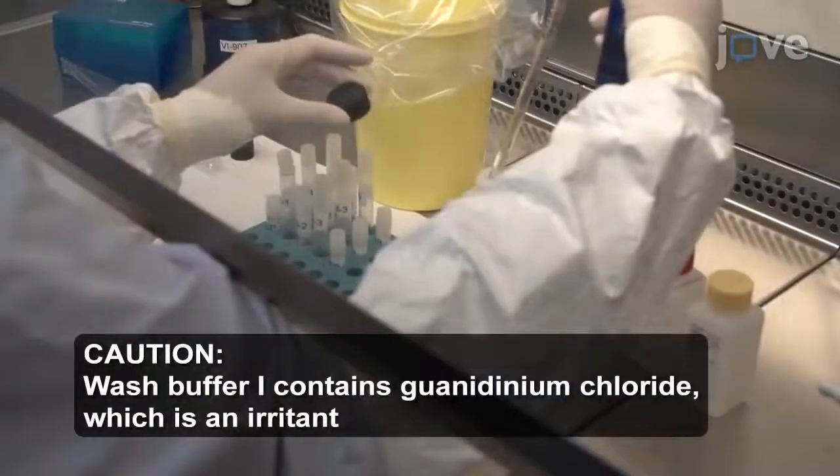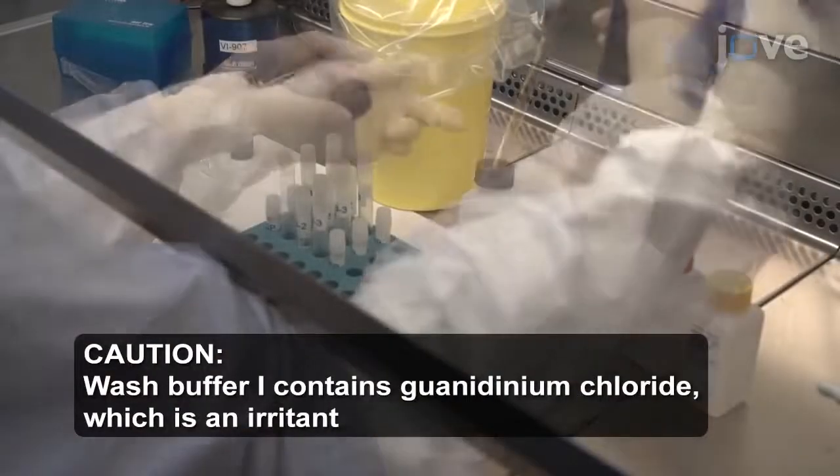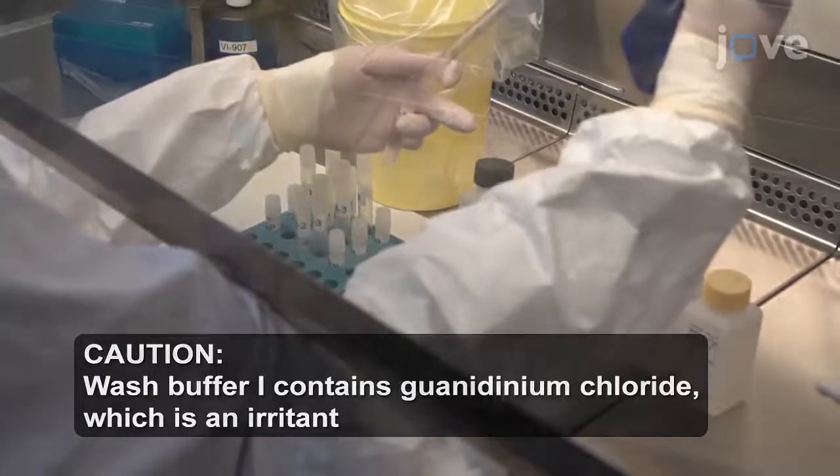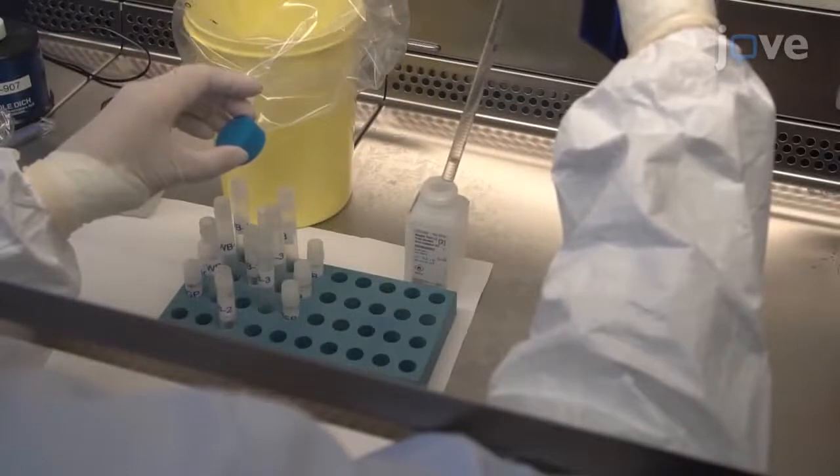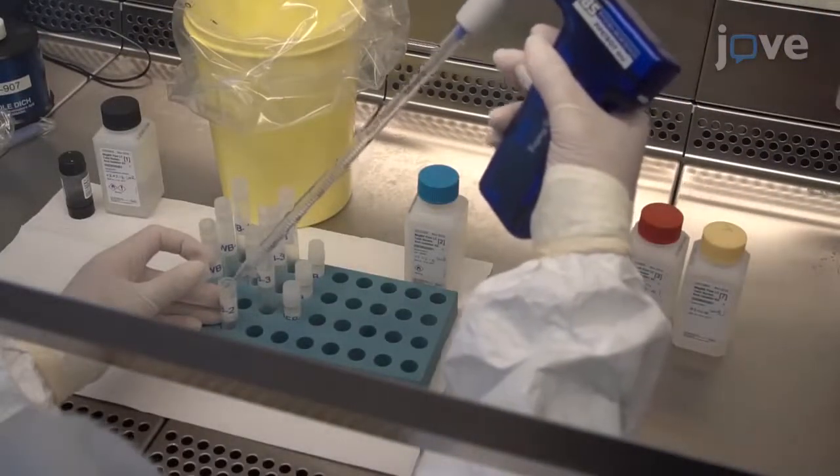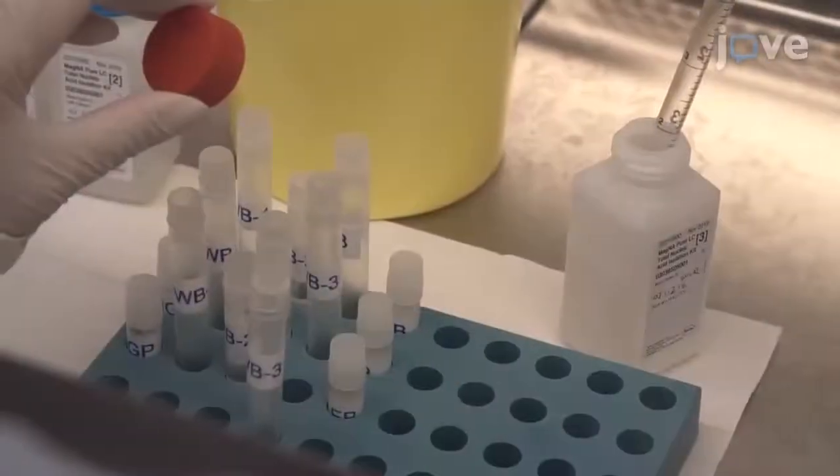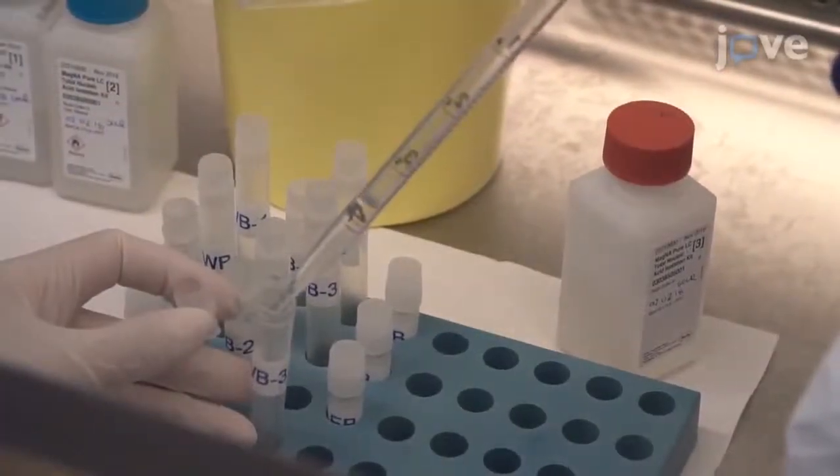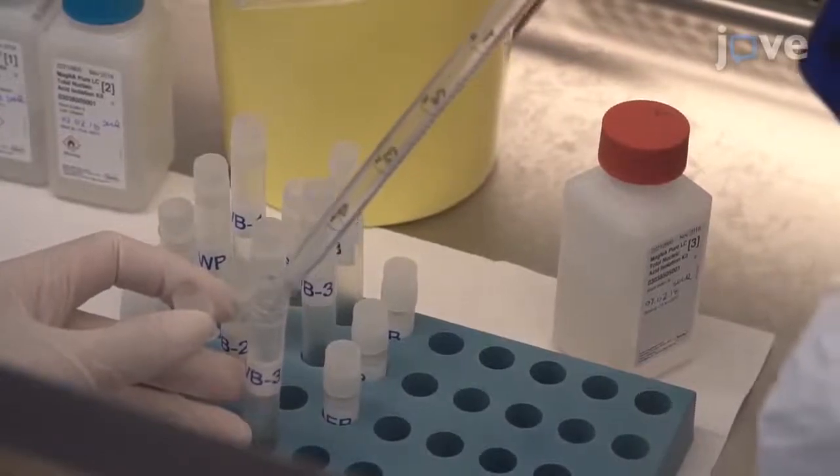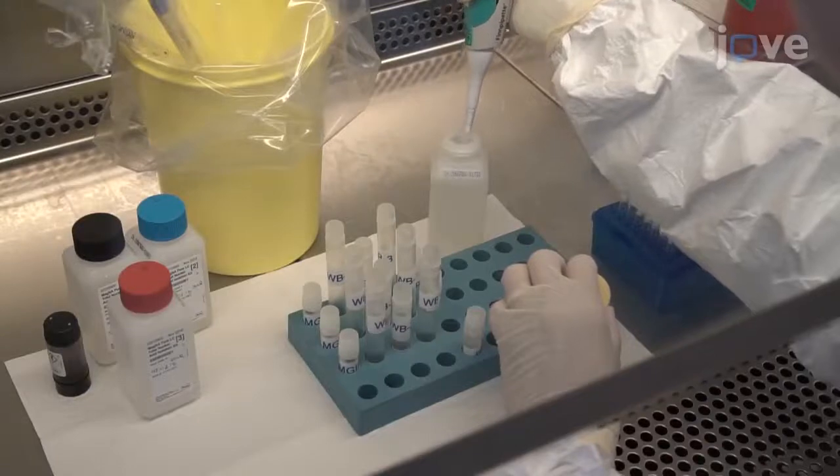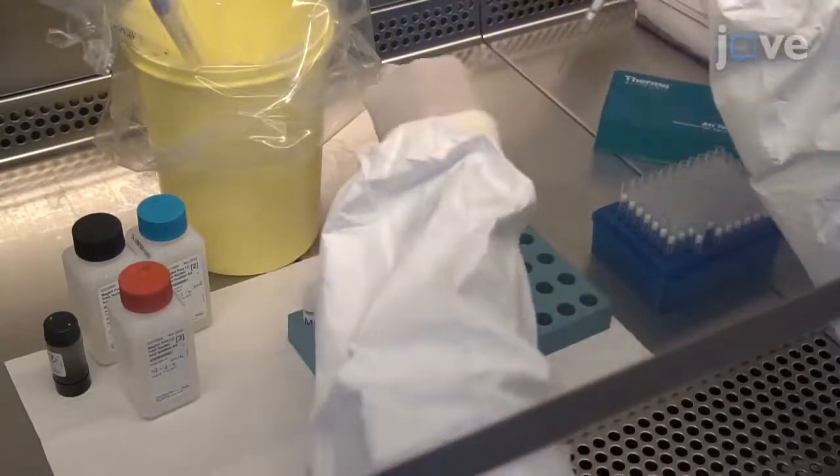Next, pipet 4 milliliters of wash buffer 1 into a 4.5-milliliter tube labeled WB1, 1.5 milliliters of wash buffer 2 into a 3.6-milliliter tube labeled WB2, and 3 milliliters of wash buffer 3 into a 4.5-milliliter tube labeled WB3. Finally, add 100 microliters of elution buffer to a 1.8-milliliter tube labeled EB, and leave the tubes at room temperature until use.